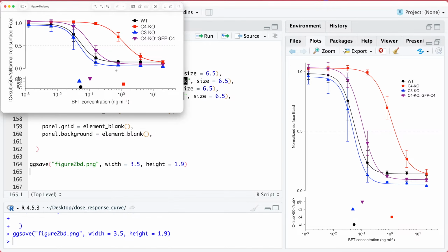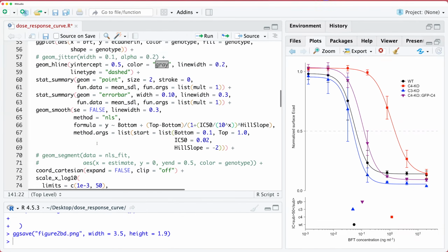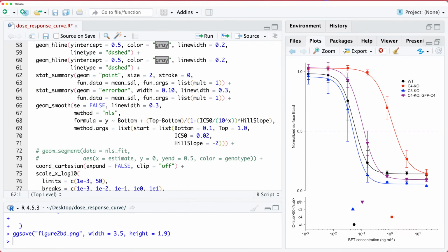We might want to have, though, a solid black line at 0 for the upper plot. So let's go ahead, back up here, and we had a geom hline already. I could basically vectorize everything to have one statement, but let's not do that. Let's do black, and then linetype solid.